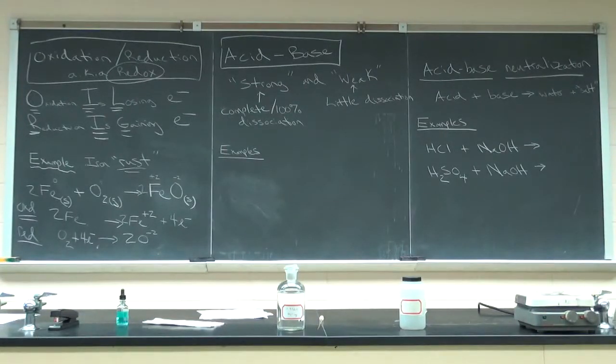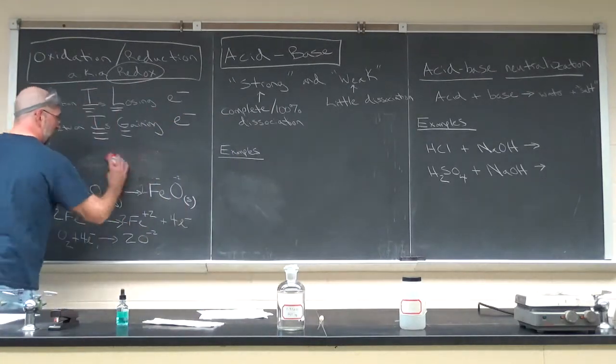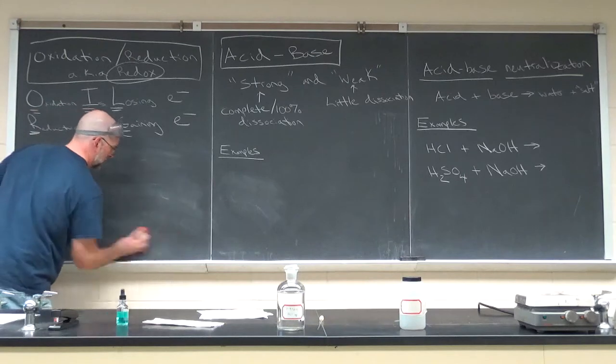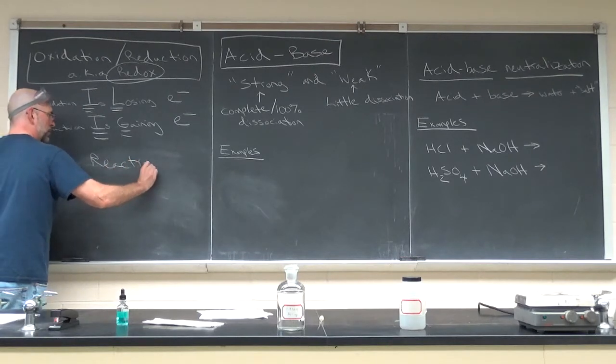All right, let me write out what's going on here. So this is reaction 1. So let's try to stay organized here. It was kind of a pain to cut that penny in half, by the way. So this is reaction 1.